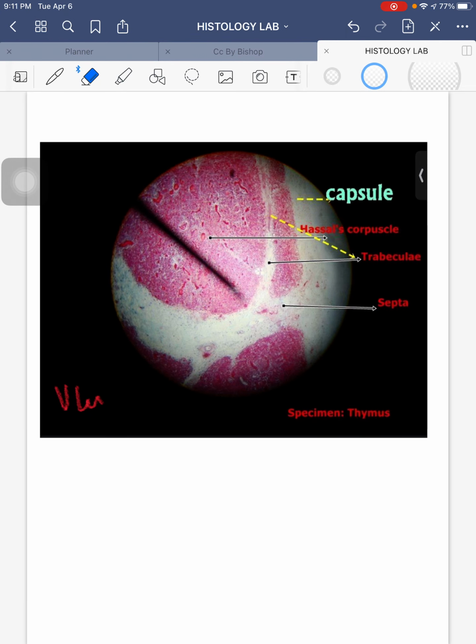Sorry, not next, back. If ever, this is the appearance, or this is what's shown, for example, in an exam. You have to really have a quick overview check of what you're looking at. So, for example, this can be your guide. This is located in a lighter area.